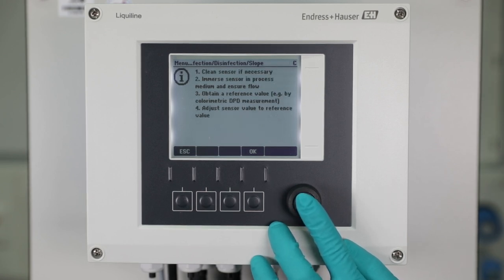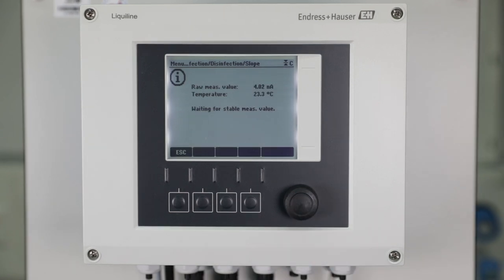The transmitter checks that the stability criteria are fulfilled and stores the present value for later adjustment. Continue with the next step in the calibration menu.